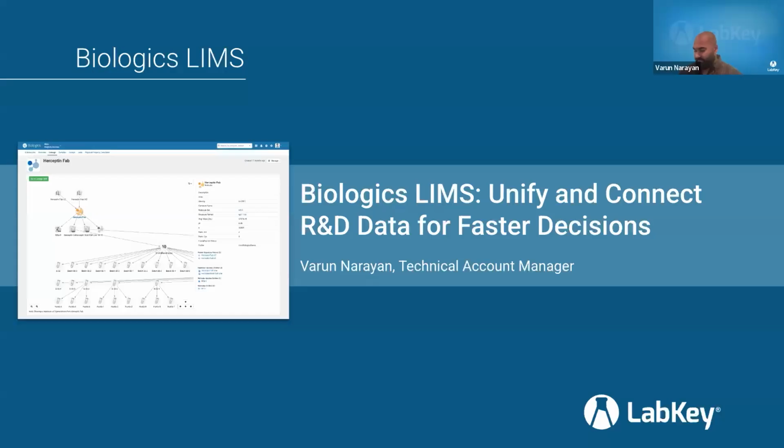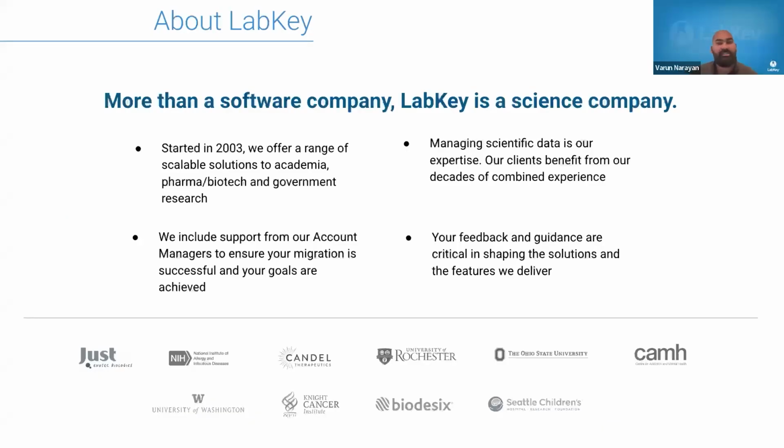But first off here, I wanted to let you all know a little bit more about who we are at LabKey. We've been around for over 20 years, and we've used that experience to provide scalable solutions to our clients in a variety of different sectors, from academia and research, all the way to biotech and pharma.